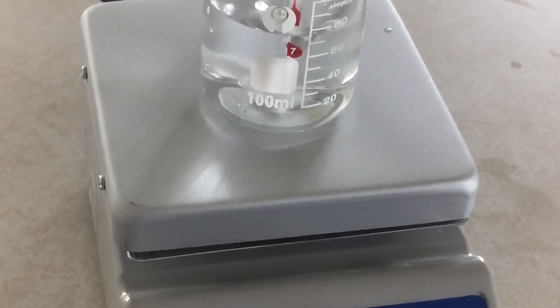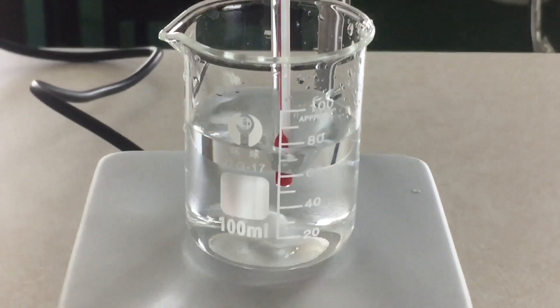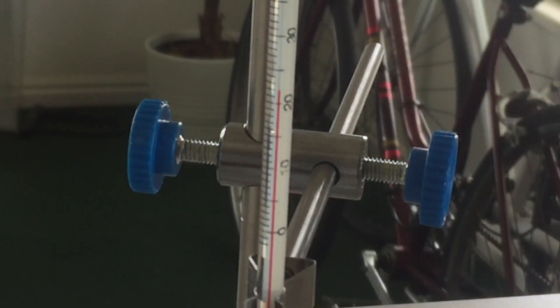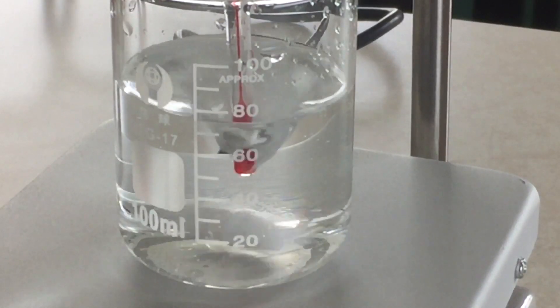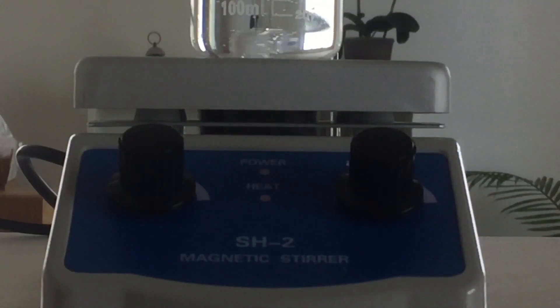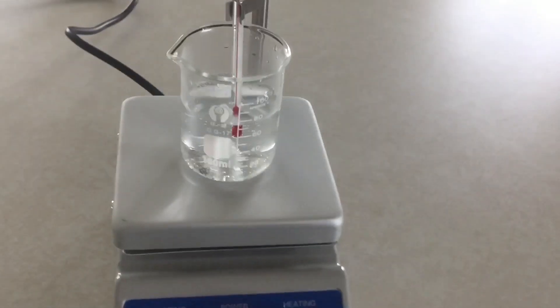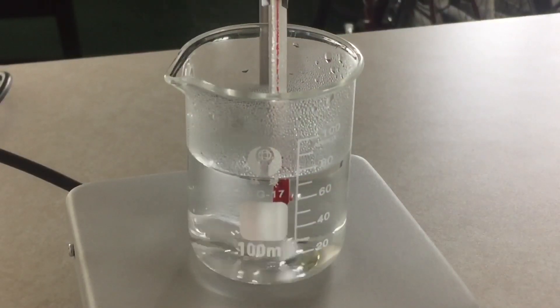We're just going to boil some water and bring it up to 100 degrees Celsius. The RPMs on this go pretty quick — I cranked it on before I took the video of it and it gets going pretty fast. According to the manual it will do up to 1600 RPMs, which is pretty fast. It's way too fast to boil water with unless you had a really large beaker.